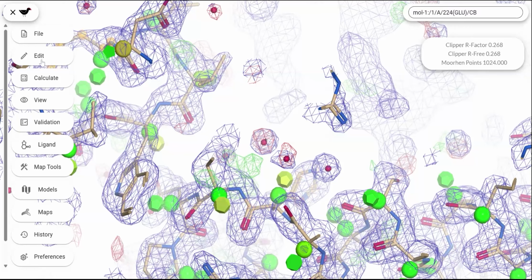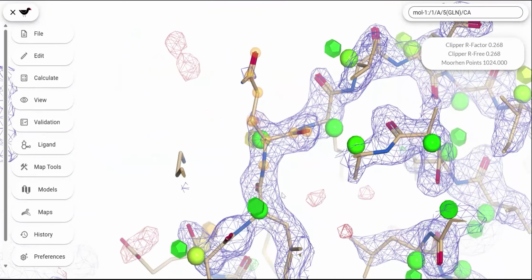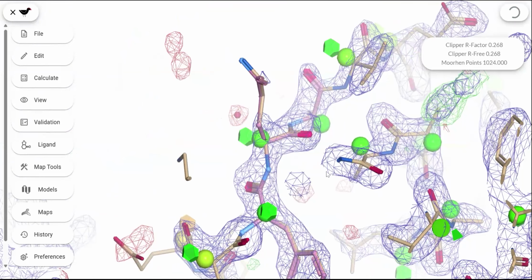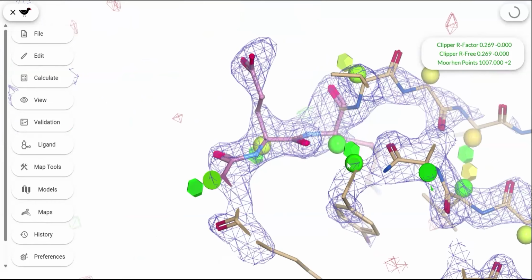If we just go to edit, go to A, and then set residue number 1, then we just press space through, and all of the parts where it's green should be fine. But if something is orange or yellow, you can try to fix it a little. Oh, it's actually significantly better. And then, for example, we can fix this a little bit too. It's a little bit better. And fix this also, if you can try.